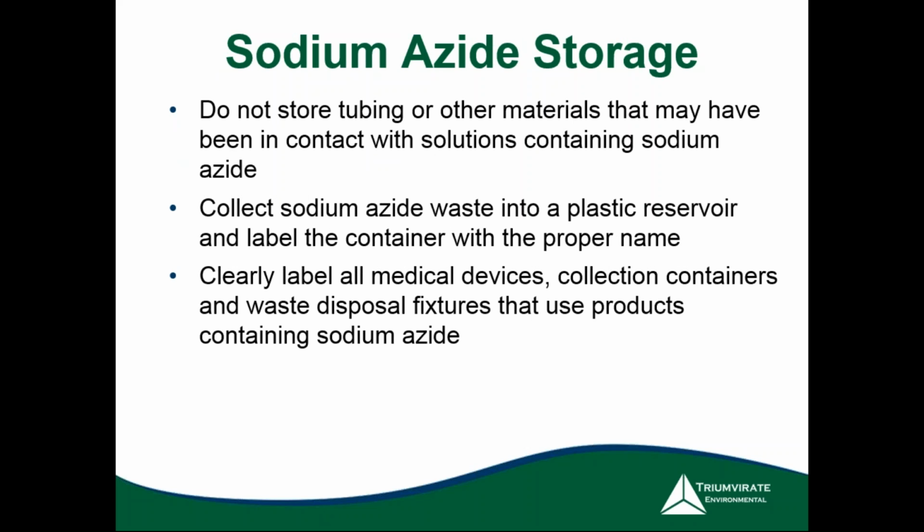Other recommendations, do not store tubing or other materials that may have been in contact with solutions containing sodium azide. If that solution is able to dry out, you can have dry sodium azide salts, which exhibit high toxicity and potentially energetic properties. Collect sodium azide waste in a plastic reservoir and label the container with a proper name. That's the best way to dispose of this, in my opinion. And clearly label all medical devices, collection containers, and waste disposal fixtures that use products containing sodium azide. And that's just, again, to alert people who might not be aware of the hazard that enter lab spaces or clinical areas of the toxicity and the potential for explosions.